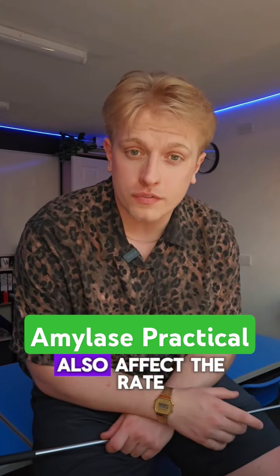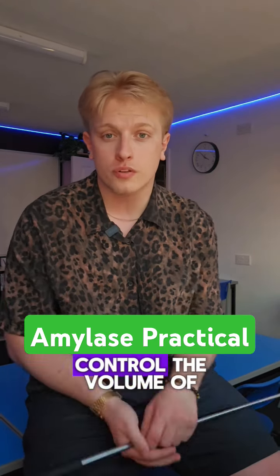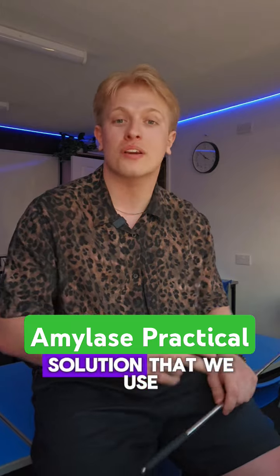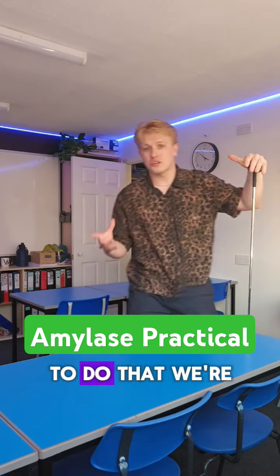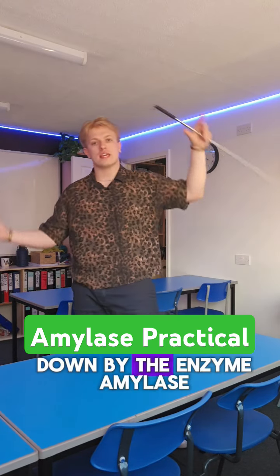Other things that could also affect the rate include the volumes of the different solutions we use. So of course we'll control the volume of the starch solution, pH buffer, and amylase solution that we use. Hold on, before we get this reaction going then, how are we going to know the rate of the enzyme activity? To do that, we're going to want to measure how rapidly the starch is broken down by the enzyme amylase.